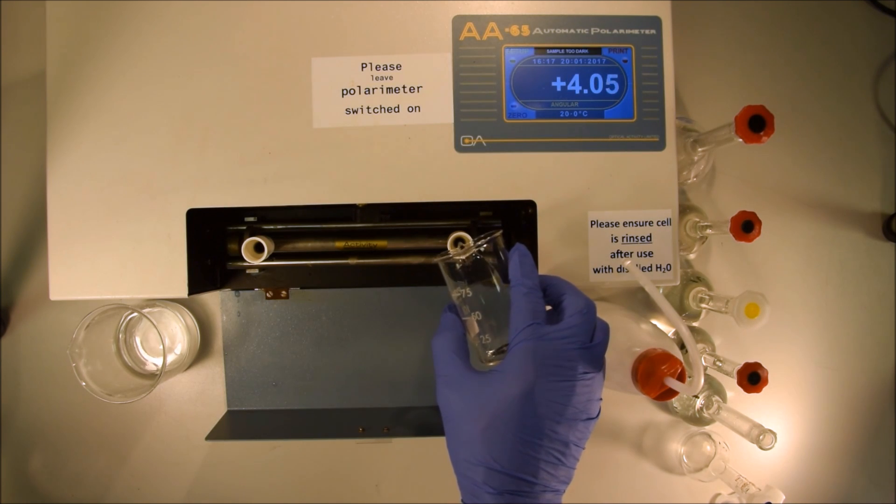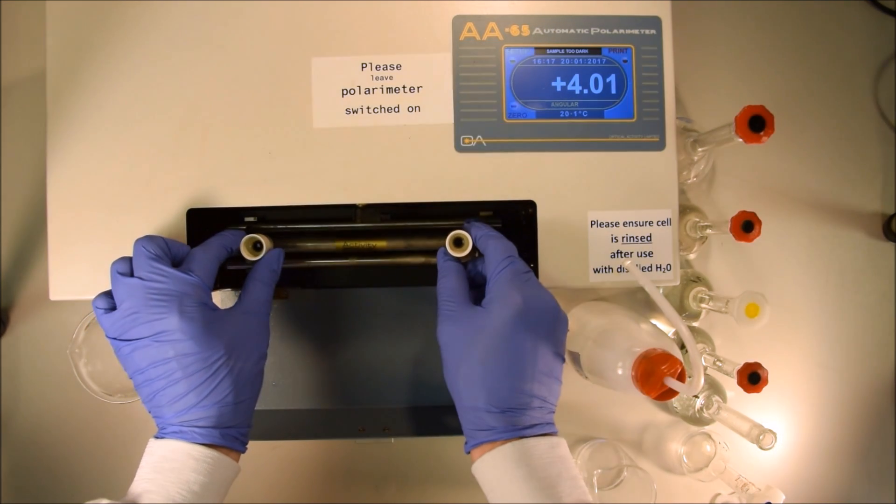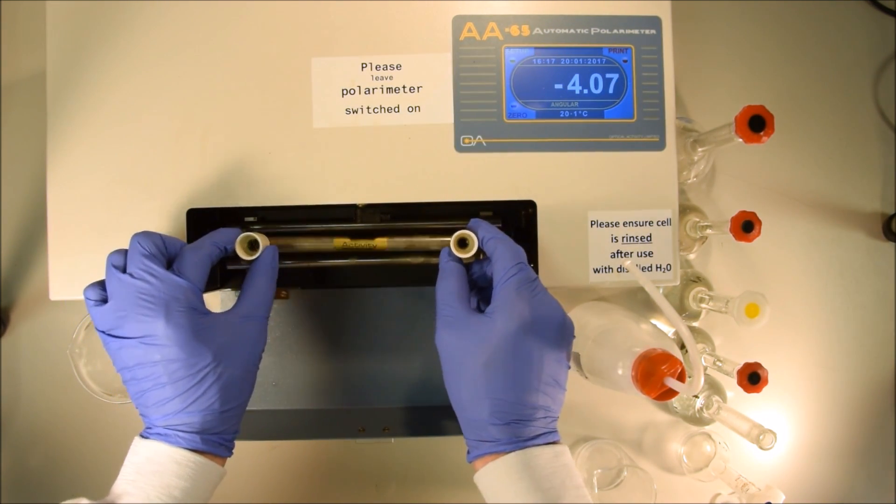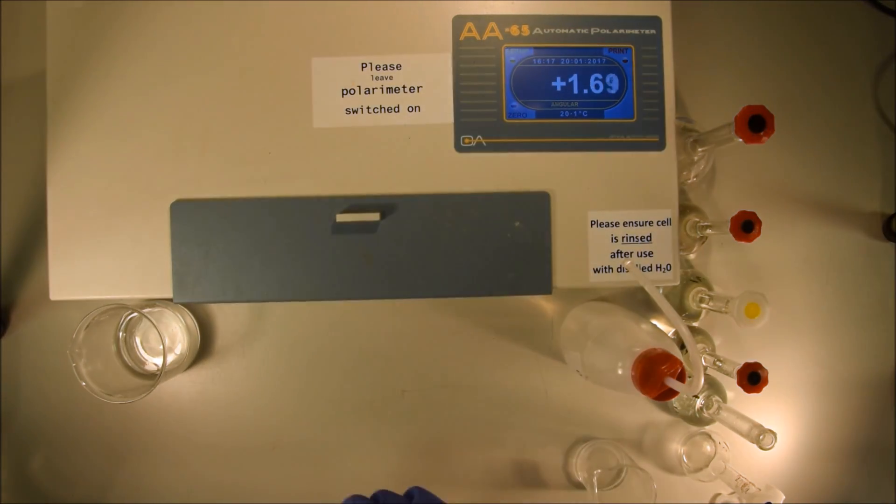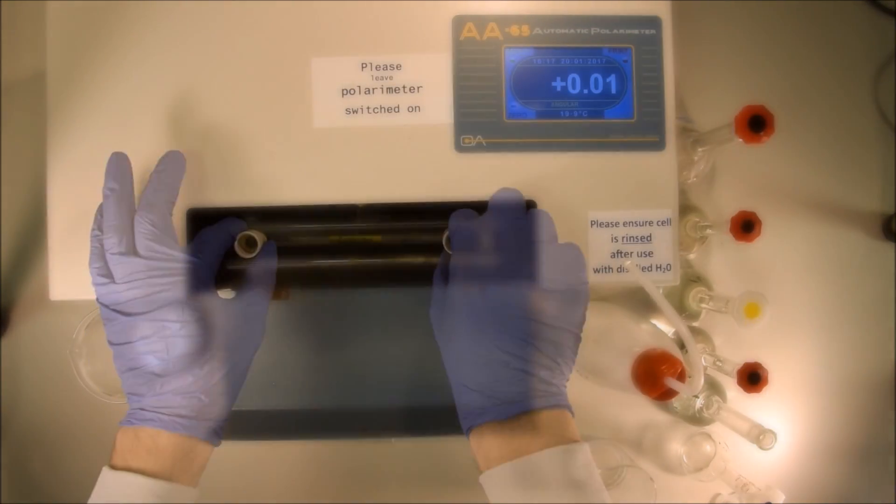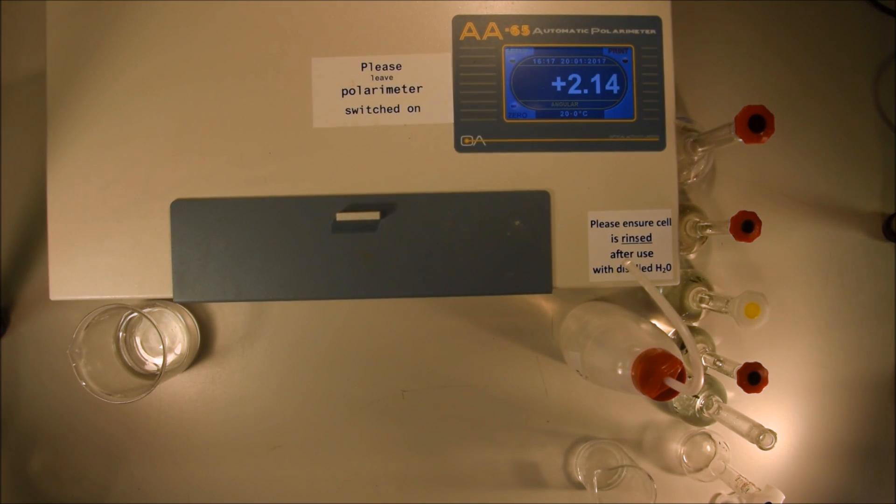I'll show you an example where I don't wash the cell out and you can see my reading is off by more than 10%. I'm filling the cell from a beaker rather than filling it directly from the volumetric flask. This is a practical convenience because some volumetric flasks have very narrow necks and it's almost impossible to fill them without spilling it everywhere.